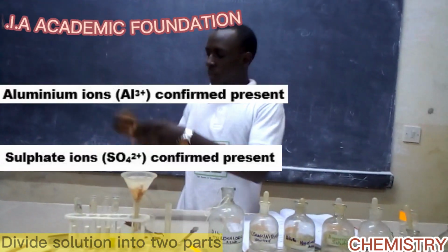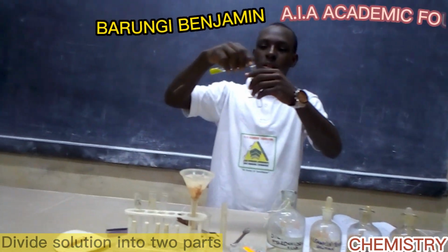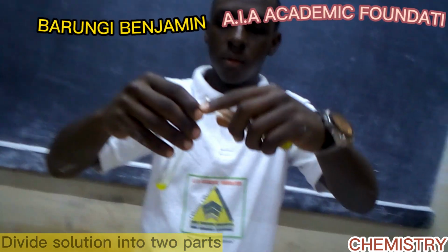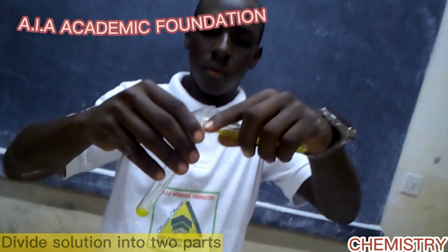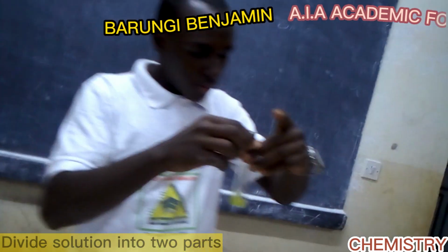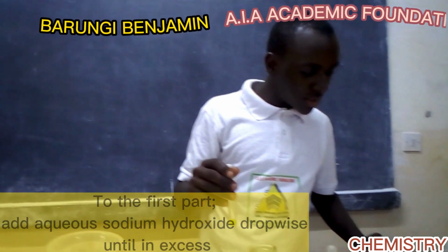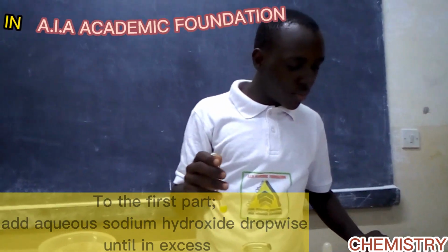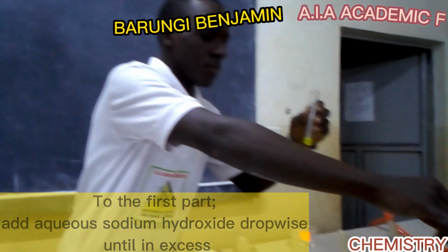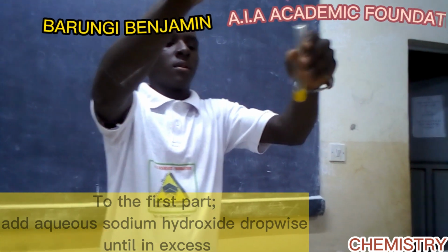So this is a clean test tube. We are going to divide the solution into two parts. And then they have told us, to the first part, add aqueous sodium hydroxide dropwise until in excess. So this is our sodium hydroxide.